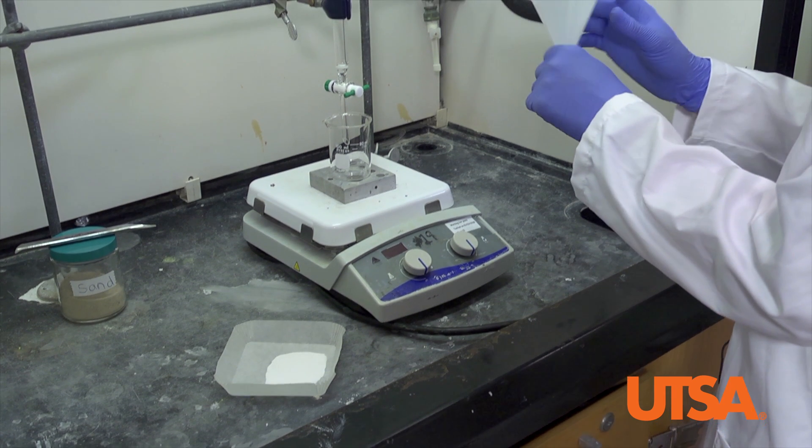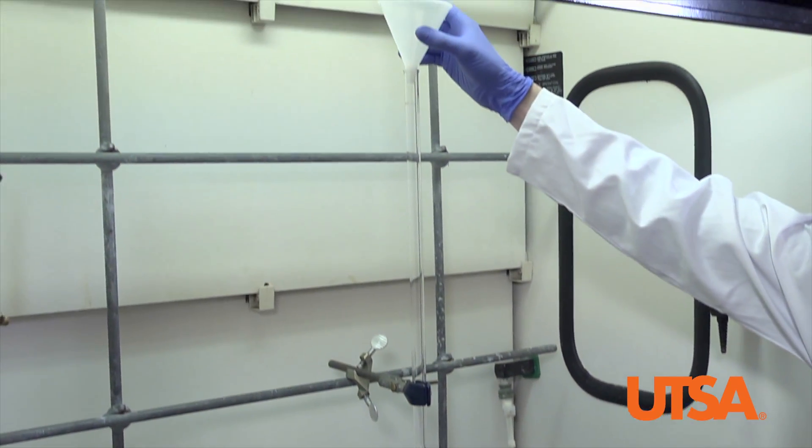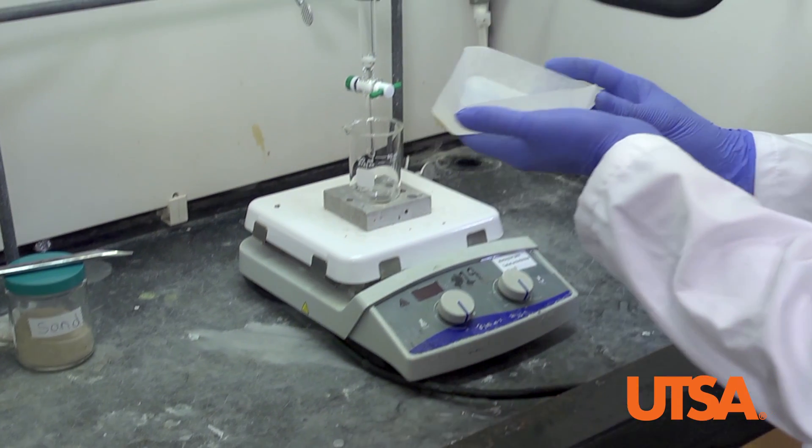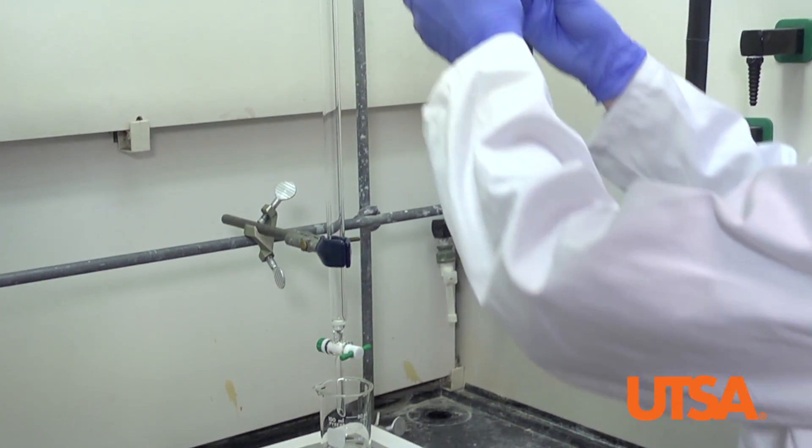Begin by securing the funnel to the top of your column. Next, add 12 grams of pre-weighed alumina to the column through the funnel.